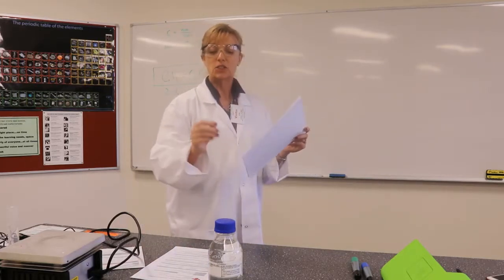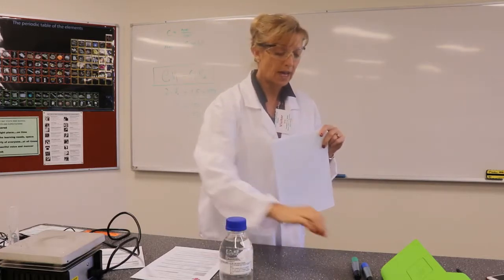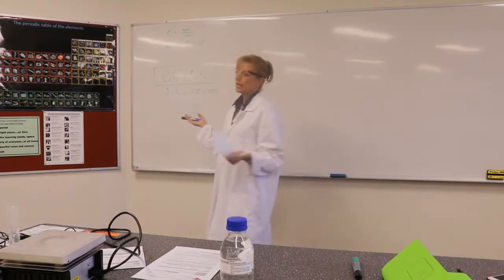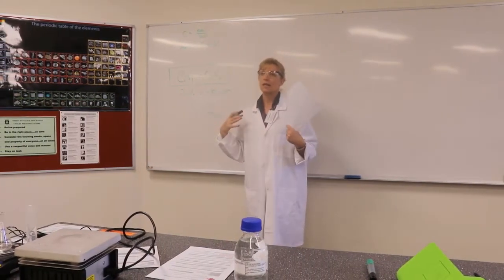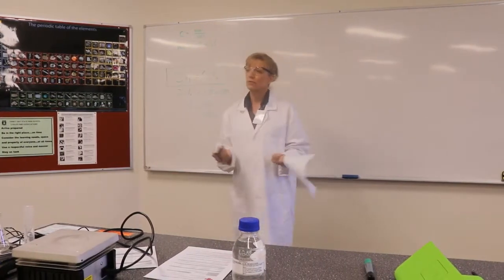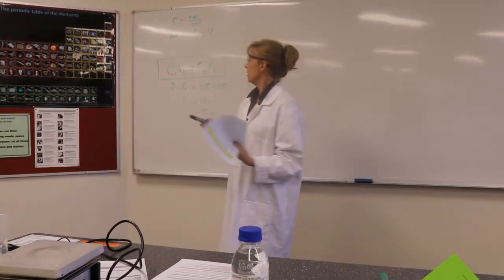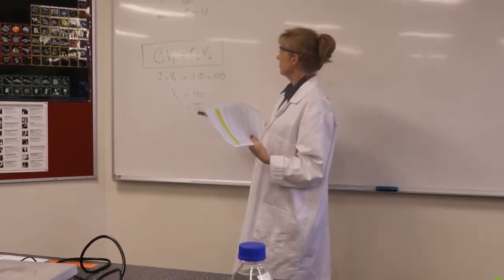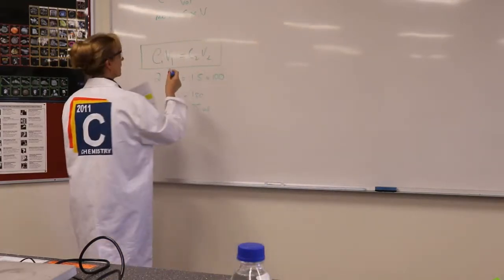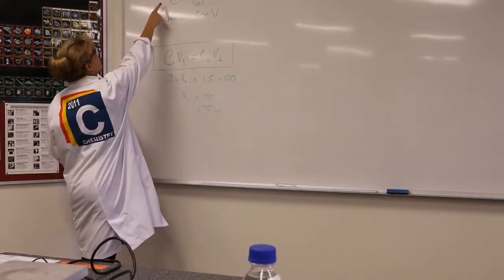The other one is changing the concentration of hydrochloric acid. So to show you that, you're going to be buying your hydrochloric acid at home from a hardware store like Bunnings, and I'm going to give you the instructions for how to dilute that down to say something like 2 molar. But then once you start with 2 molar, you should be able to make any concentration you like by using this formula. So I'll just start very quickly from the most basic concept.